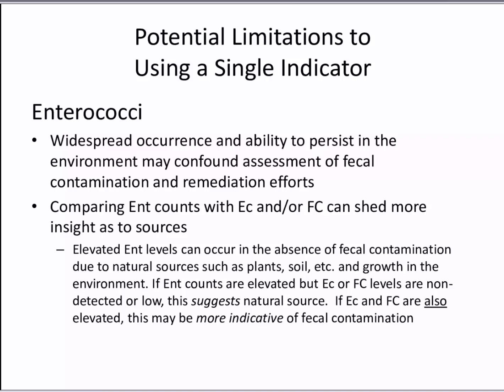First, starting with Enterococci, because you heard they're widespread in occurrence and they are able to persist in the environment, so this may actually confound assessments of fecal contamination and remediation efforts. That's a huge limitation.